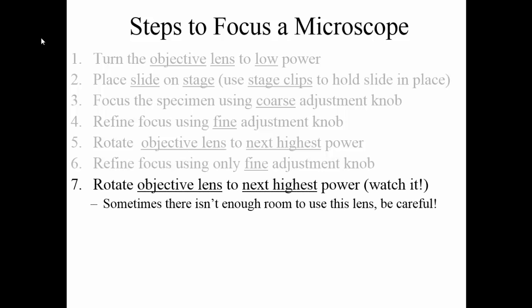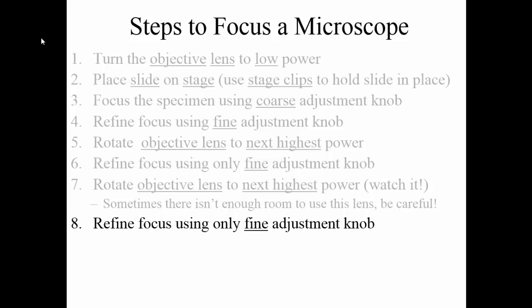Once you've got it in focus on medium power, you can choose to stop depending on the specimen, or you might need to rotate it to the next highest power — for our microscopes, that's the third objective lens, the highest power you're going to be using. At this point, watch from the side as you're rotating it. The highest objective lens is also the longest, so you want to make sure it's not going to break the slide. The high power objective lenses do have some springs, so they have a little give, but don't force it too much because you risk breaking the slide or the lens. If you get to high power successfully, again refine the focus using only the fine adjustment knob — do not use the coarse adjustment knob, as that makes bigger adjustments and you could break the slide.